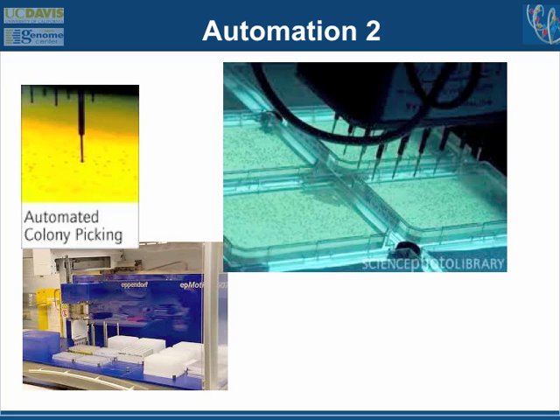So there were a lot of robots that were developed that would take a picture of these plates of E. coli colonies. Then software would tell this automated picker where to go pick up a single colony and drop it off into a little growth microtiter dish. And then you could have an automated robot, which other companies sold or developed, for doing DNA preps from those colonies that were grown in these microtiter dishes. And eventually, sequencing got what we thought was really cheap, which was down to maybe 50 cents per sequence that came out of this type of protocol.